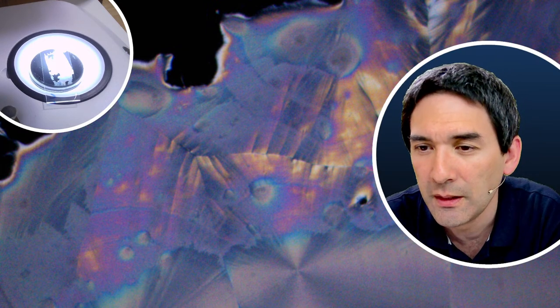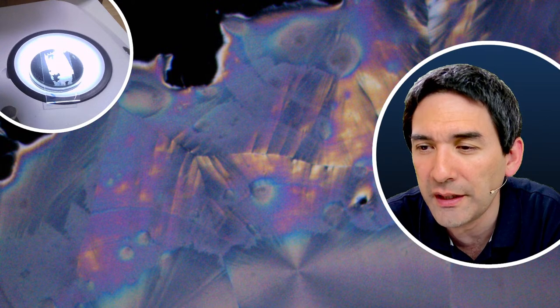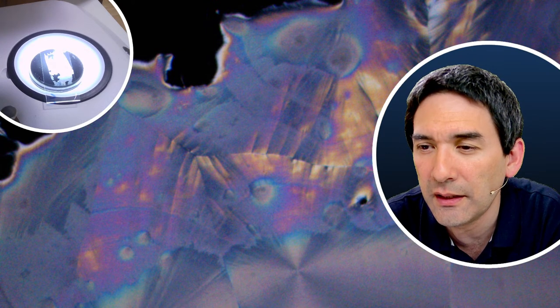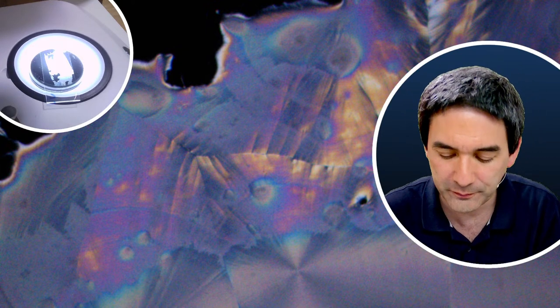Okay. Yeah, so if someone is using a stereomicroscope with a Barlow, they can also put a sheet of polarizer between the lens and the Barlow. Then you can use bigger specimens as well, like insects. Yeah, so the question was the following right now.